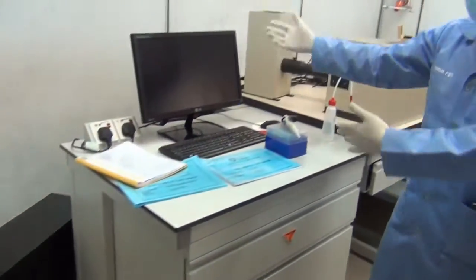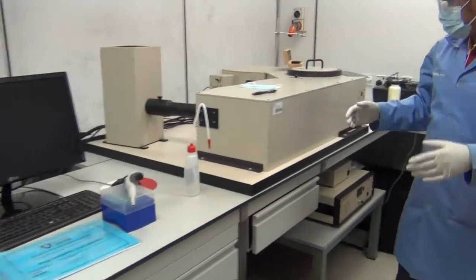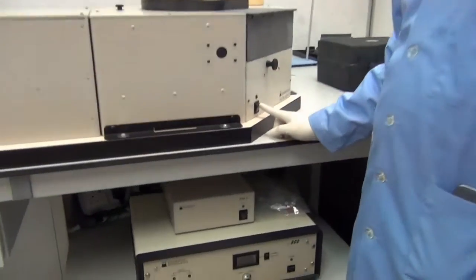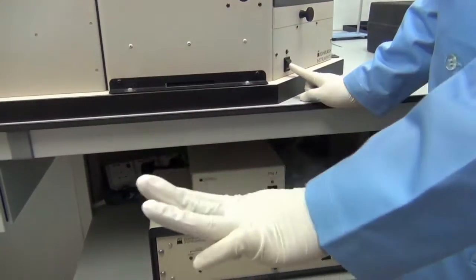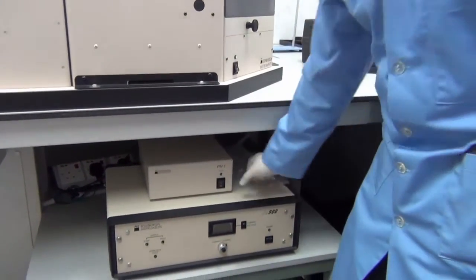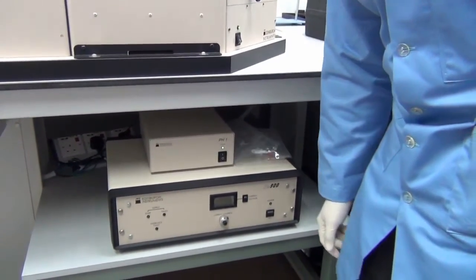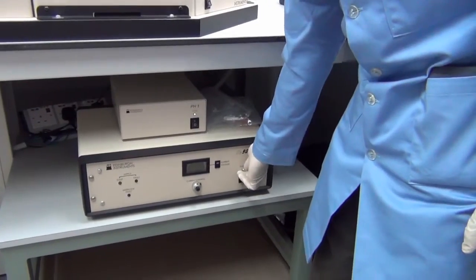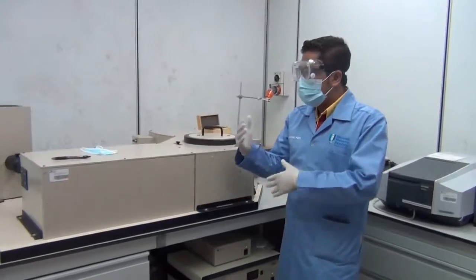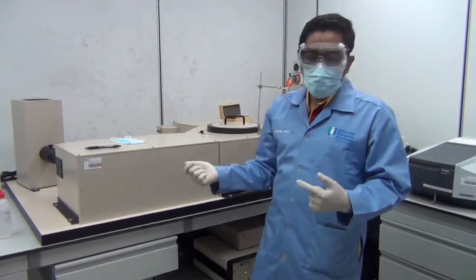And let the computer start up. And go to the machine. There is 1 switch over there. So we have switched on 3 switches just now. This is the 4th one. 4th, 5th, and 6th. Let the computer and the instrument warm up properly. Then we go for your sample.